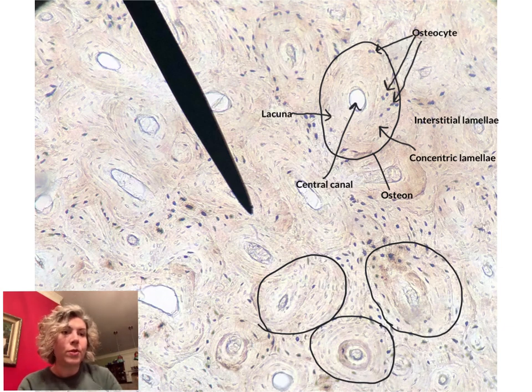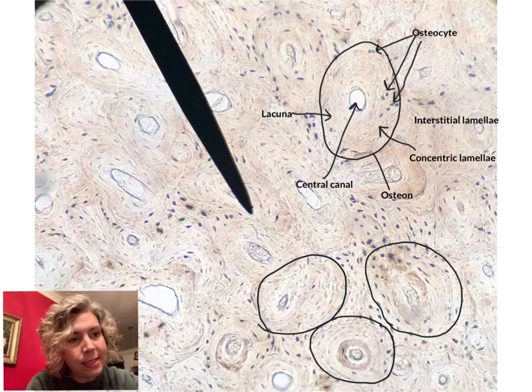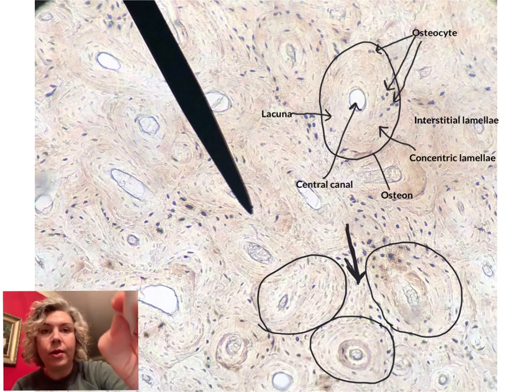I won't circle that 4th one just because I don't want to mess up the labeling over there at the top. But you'll notice with these osteons being circles, they don't fit flush with one another. There's spaces between them. Well, that space has to be filled with matrix. That matrix is what we call interstitial lamellae. Interstitial means between. That prefix inter means between. So interstitial lamellae is this area right in here. It's usually left over from maybe an earlier osteon, an older unit that's there.